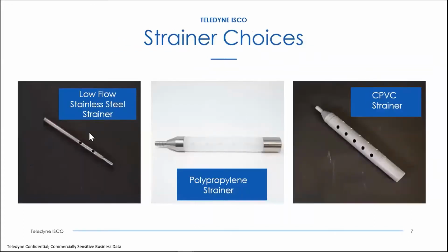Next, we talk about strainers. It's important to get the right strainer for your application. The strainer is the part that actually goes into the water.